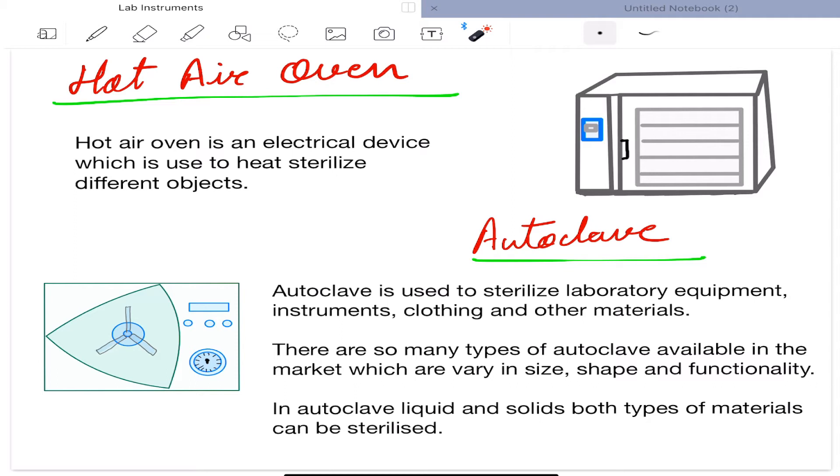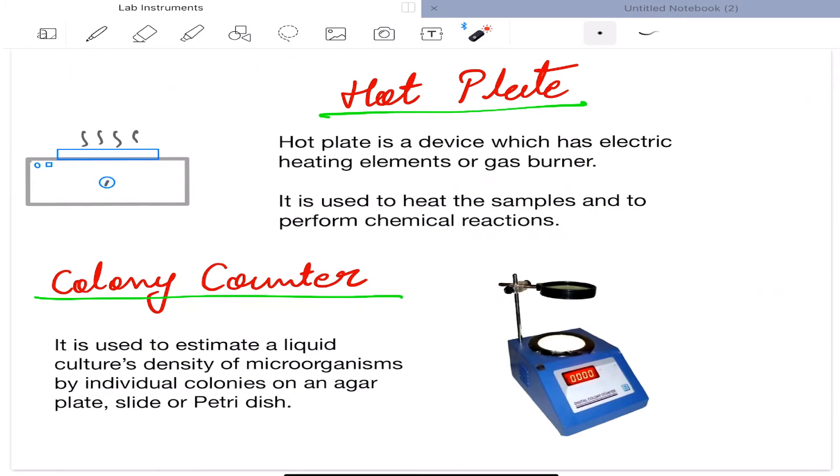Hot air oven is an electrical device which is used to heat sterilize different objects. Next is autoclave. Autoclave is used to sterilize laboratory equipment, instruments, clothing, and other materials. There are so many types of autoclaves available in the market which vary in size, shape, and functionality. In autoclave, liquid and solids both types of materials can be sterilized.